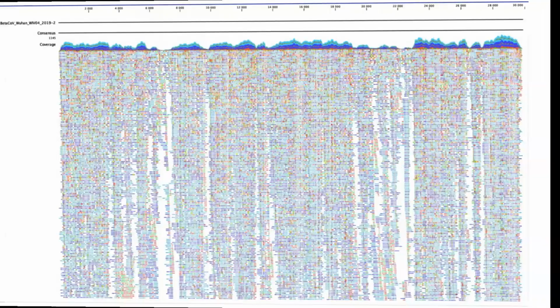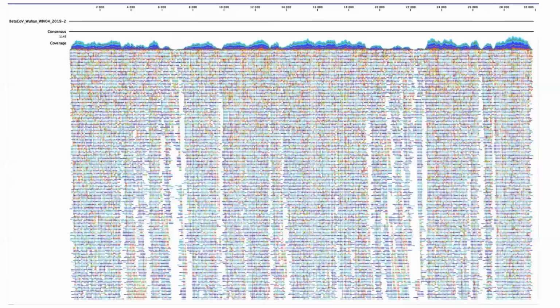Genomes are assembled from next generation sequencing, which is typically done using a process called shotgun sequencing. This process includes shattering the source material, which is going to be RNA or DNA, and then sequencing short reads that are 30 to 300 base pairs long. These sequences are going to be assembled into a full genome by looking at the consensus sequence.